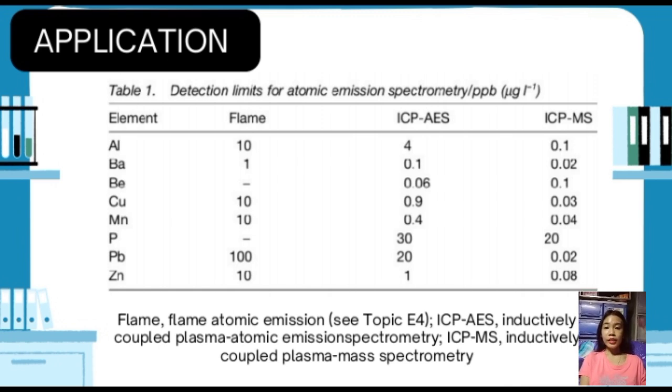By utilizing ICP-AES to measure the concentrations of essential nutrients such as nitrogen, phosphorus, and potassium in various fertilizers, students can make educated decisions about which product may be most effective for their gardening or agricultural projects. These hands-on experiments not only reinforce classroom theory but also provide students with practical skills relevant to agricultural sciences.